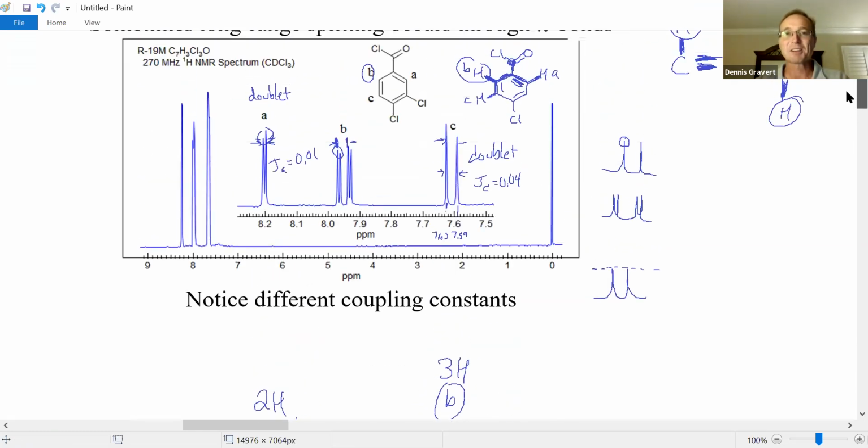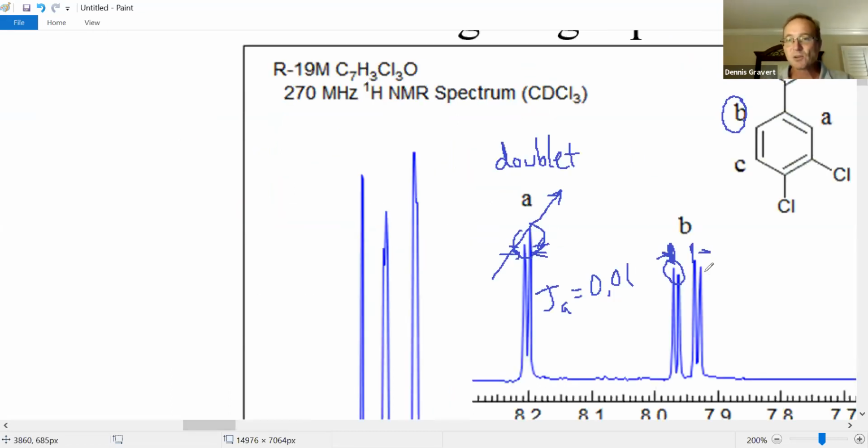Let's just check. Is that working over here? Yeah, so look at C. C is tilting. Well, that doesn't help. There's 2 peaks over here. They're all over here on the left side. C, of course, you can be pointing that way. And so is A. A is pointing that way. But if you can zoom in, I can zoom in. Take a look at B. So the little peak splitting here, oh, I marked it all up, but you can see how this is pointing to the left, saying, hey, the little neighbor, the long distance neighbor is actually A. And then B, this peak is higher, it's going that way.